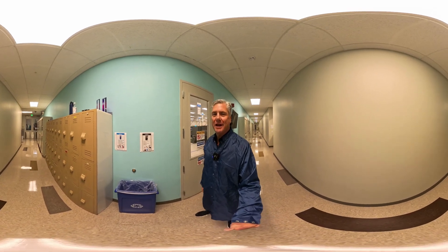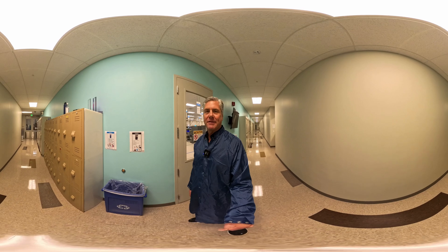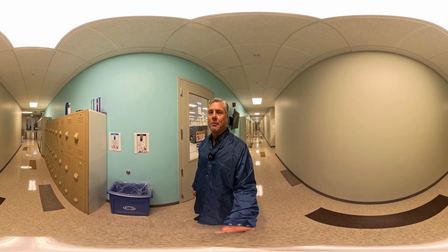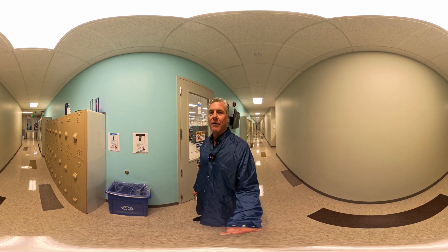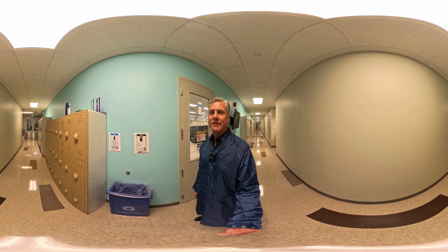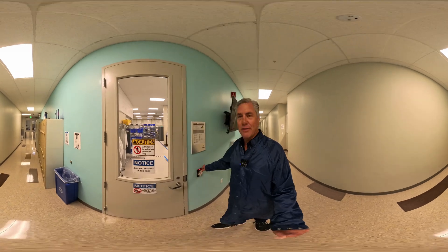Hey everyone, it's Christian Henry here and I'm the CEO of PacBio. One of my favorite aspects about working for PacBio is the fact that we make all of our own products and we manufacture them here right in the United States. What I want to do is show you a little bit of our instrument manufacturing where we make the Revio and Onso instruments. So let's go take a look as we head into our manufacturing facility here.